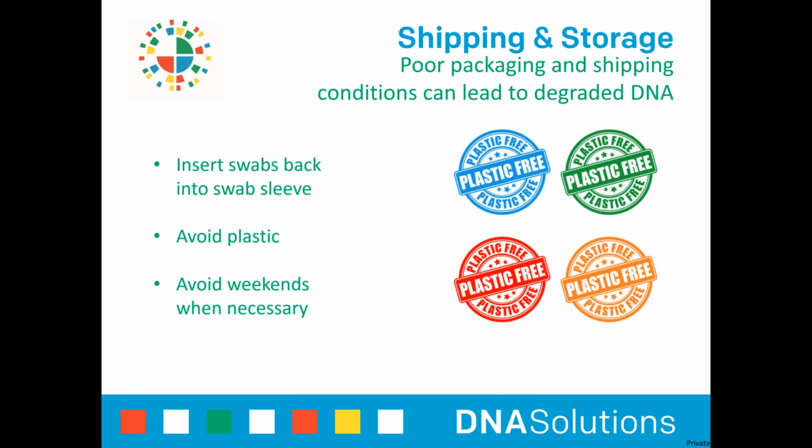When packaging and shipping your samples, it is important to keep these things in mind, as poor packing and shipping conditions can lead to degraded DNA. Once sample collection is completed, it is important to place the swab back into the swab sleeve before inserting it into the sample envelope. Please do not put any materials that have DNA or potential DNA on them into plastic bags or containers.